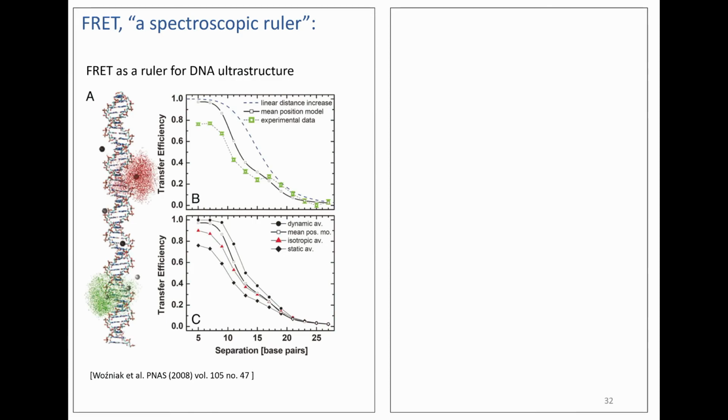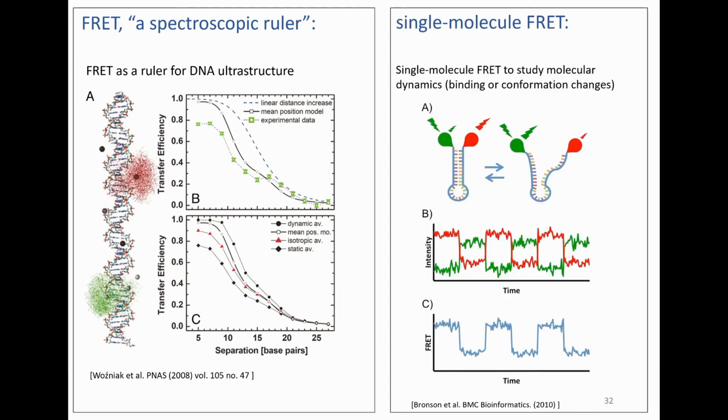And so finally, I can show you how people have in fact used FRET also to measure distances. So here they've just attached donors and acceptors at predefined positions along DNA strands, and you can see how really the FRET signal, the FRET efficiency, behaves as we've seen from the theoretical calculations, the considerations that we had beforehand. So for these systems, it provides this information.